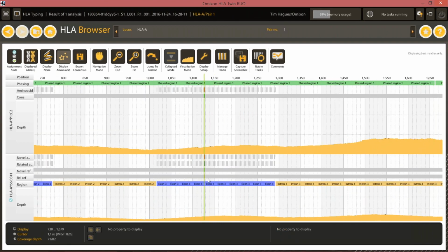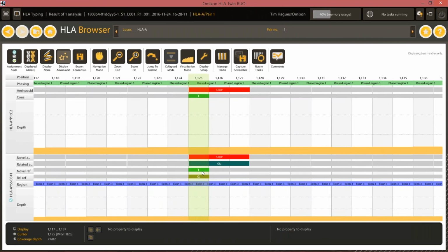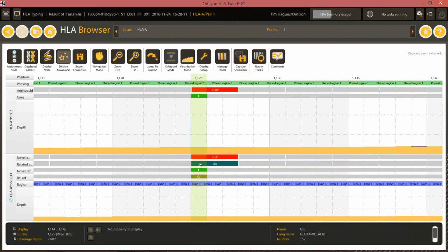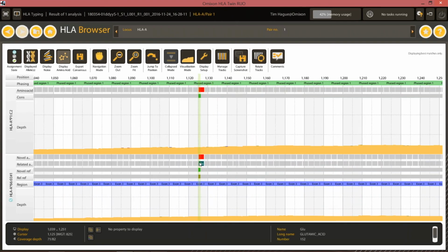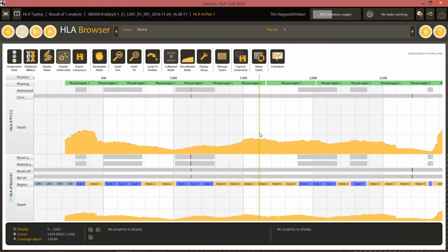And if I look at the coding sequence, where the difference is in exon 3, I can see that I actually have a T substitution. So the reference sequence from the database has a G at this position. The actual consensus sequence for this sample has a T, and that has converted this glutamic acid into a stop codon. So this is a novel null allele with a stop in the middle of exon 3, which I think is a nice demonstration of this new amino acid feature.